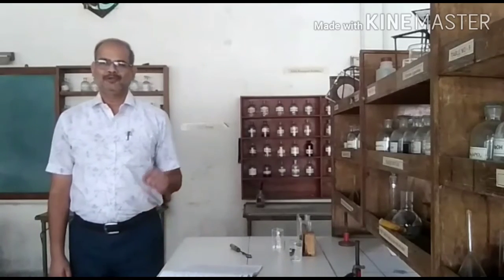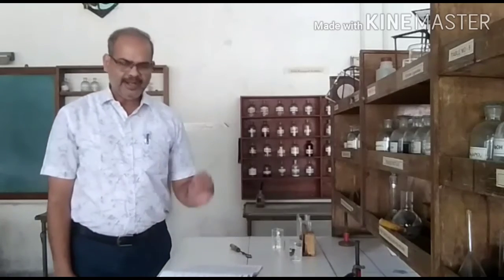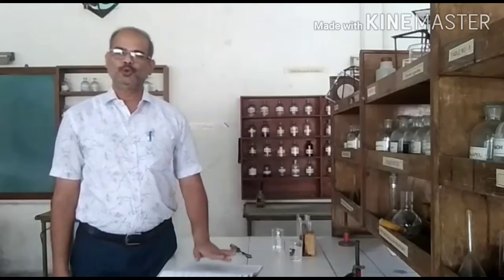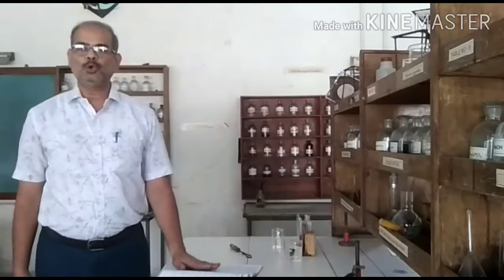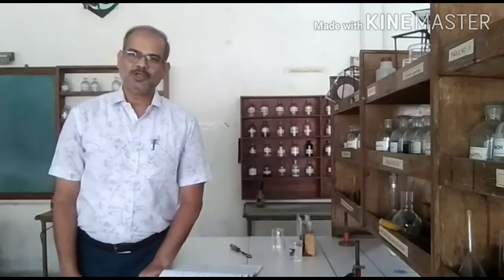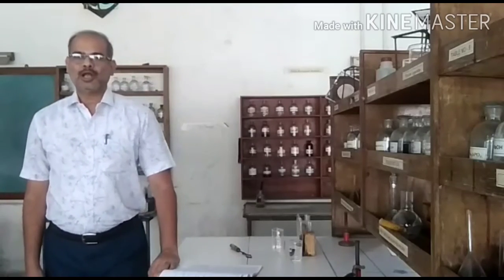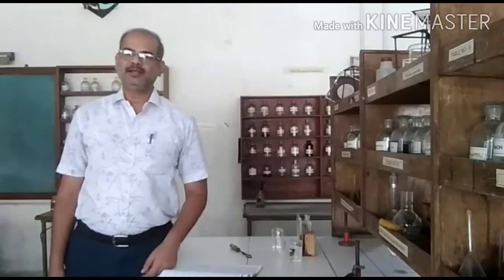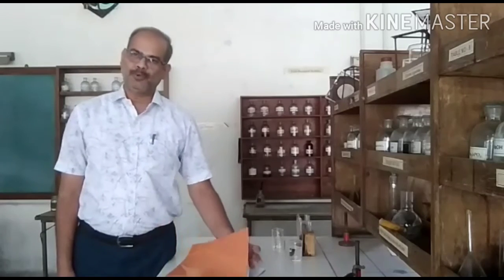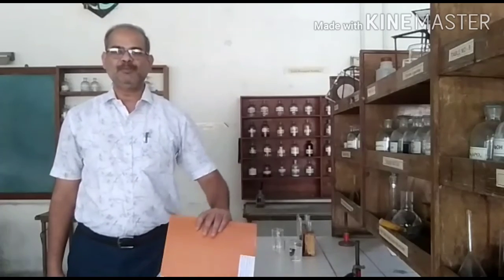So this is how, very systematically, reading carefully the handbook and understanding what you have to do, you can perform the experiment and score full marks in this particular practical. So this was how to detect the two acidic radicals from the given unknown mixture. I hope you people have understood it. Go through the handbook properly. It will be very simple for you people.